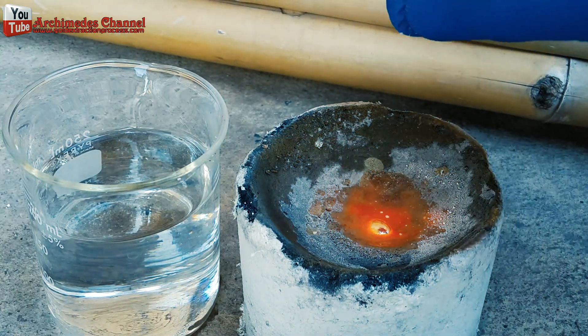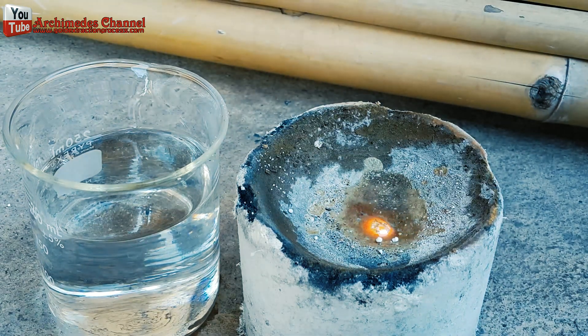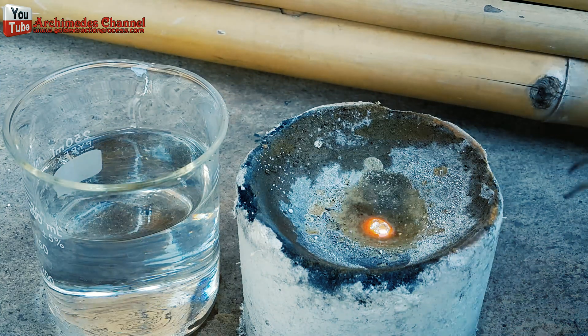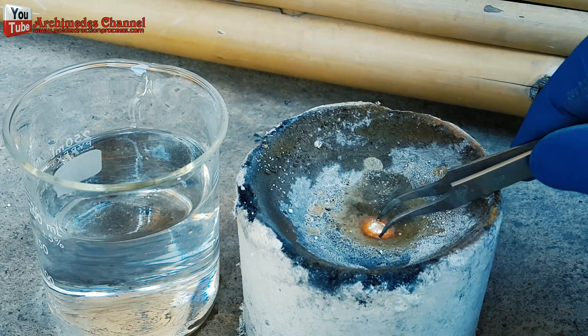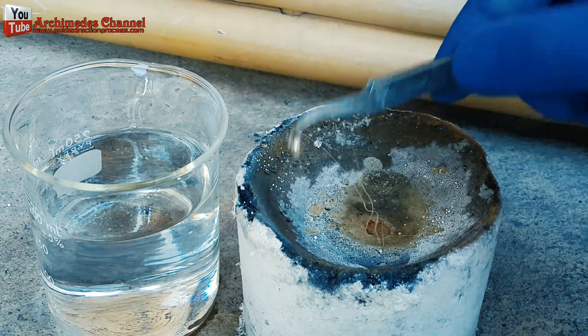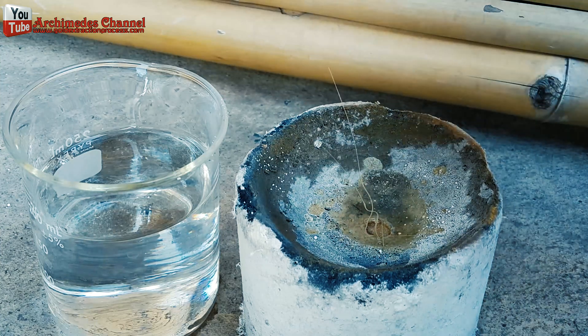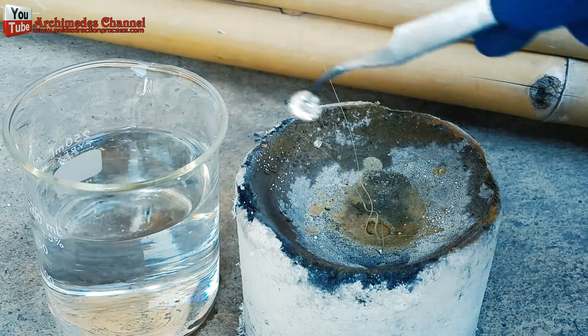Use water mixed with hydrochloric acid, 1 to 1, for cleaning silver. This is the silver sample I received. If you are interested in silver, let's do it.